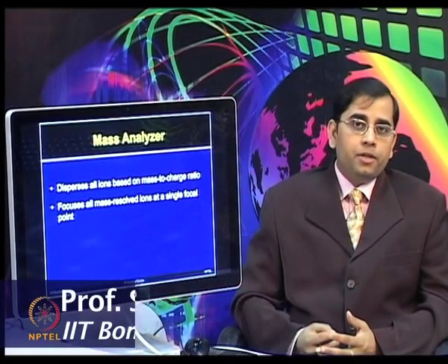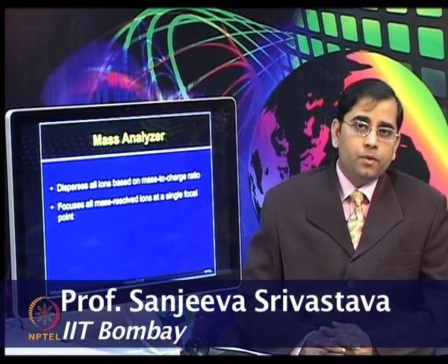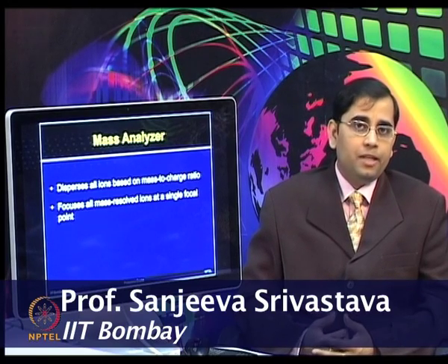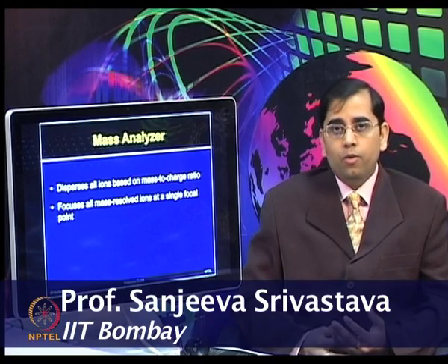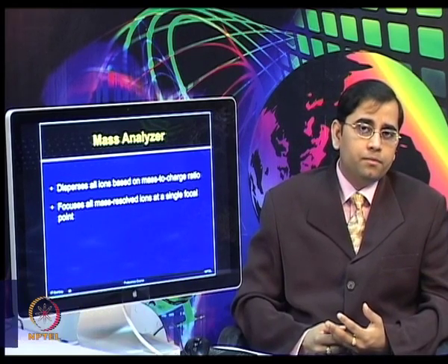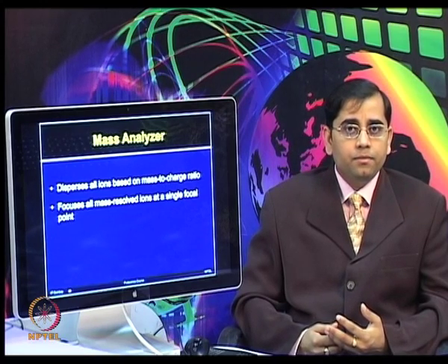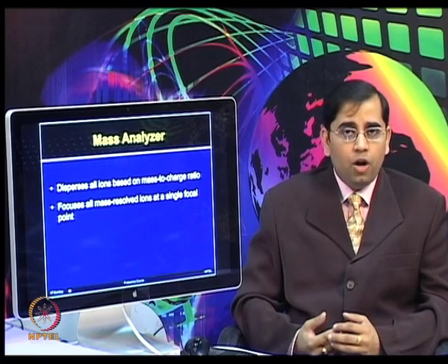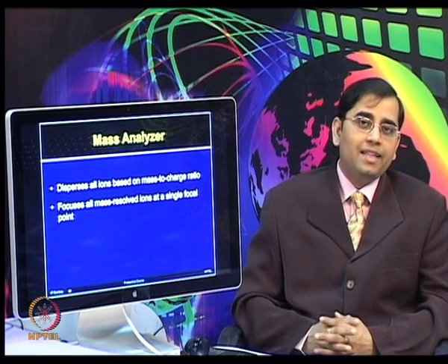So, we are talking about an MS experiment and I am trying to give you an overview of various steps involved. First of all, we looked at liquid chromatography based pre-fractionation, in-gel digestion, and different types of ionization sources, and now let us move on to the mass analyzers.